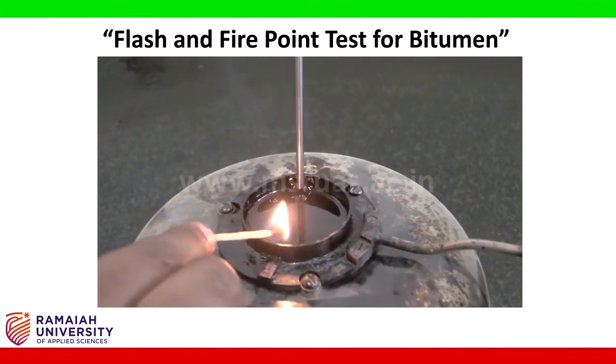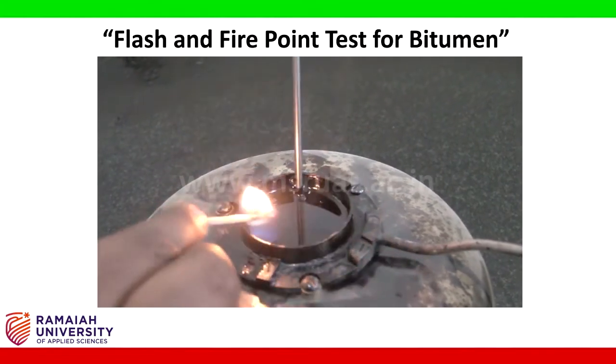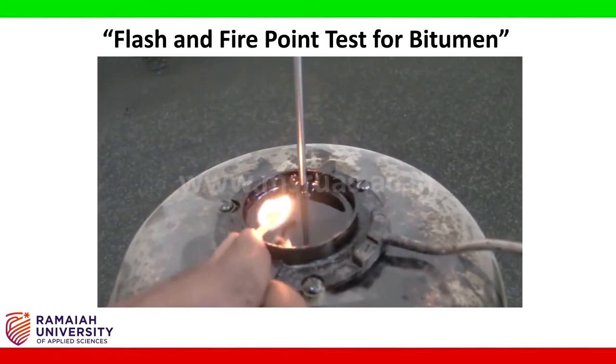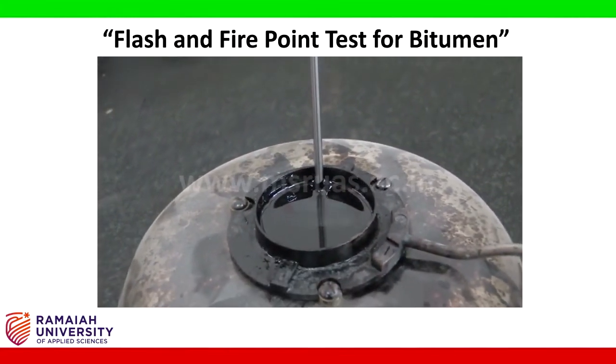At one particular temperature, what happens? The bitumen starts showing the flash. You just observe here. If you keenly observe, the flashing started now. Okay, wait for a minute or two.